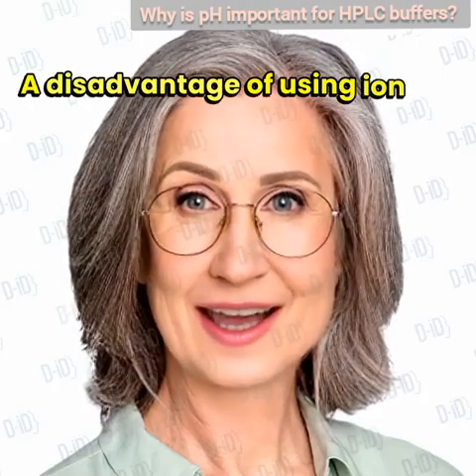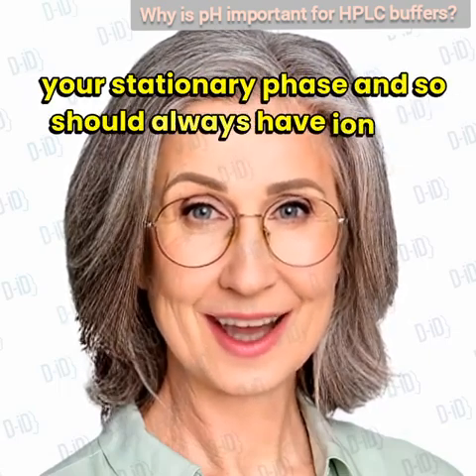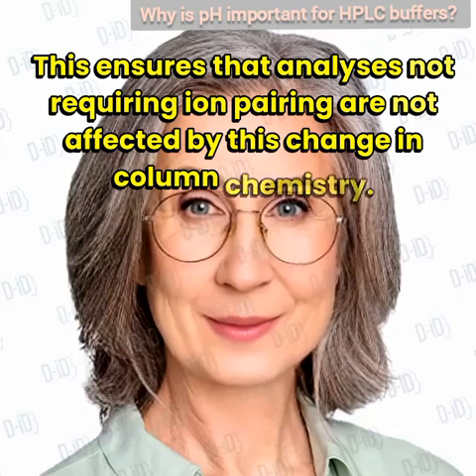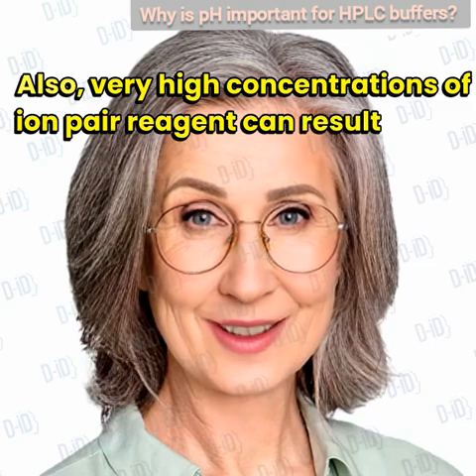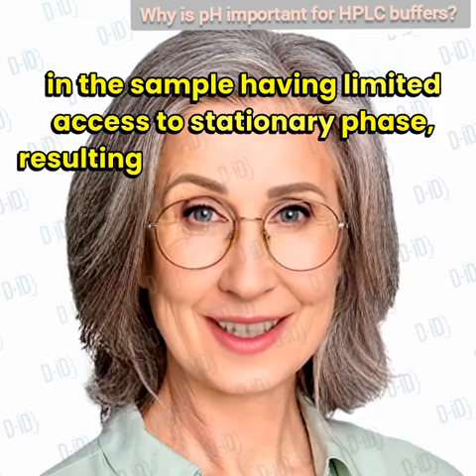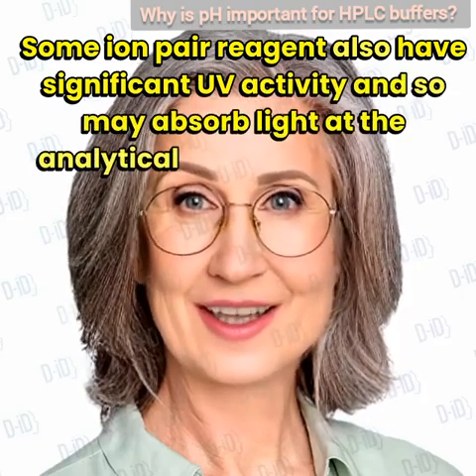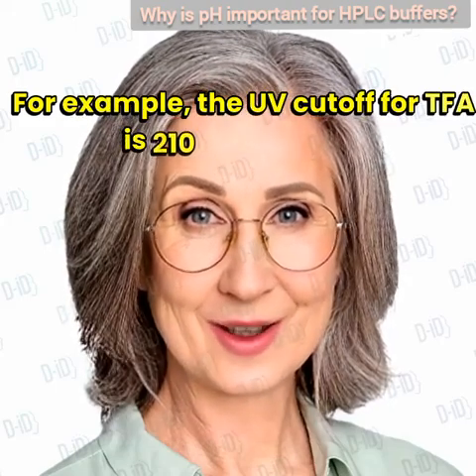A disadvantage of using ion pair reagents is that you are chemically modifying your stationary phase and so should always have ion pair dedicated columns. This ensures that analyses not requiring ion pairing are not affected by this change in column chemistry. Also, very high concentrations of ion pair reagent can result in any neutral analytes present in the sample having limited access to stationary phase, resulting in decreased retention. Some ion pair reagents also have significant UV activity, and so may absorb light at the analytical wavelengths being used with UV detection. For example, the UV cutoff for TFA is 210 nanometers.